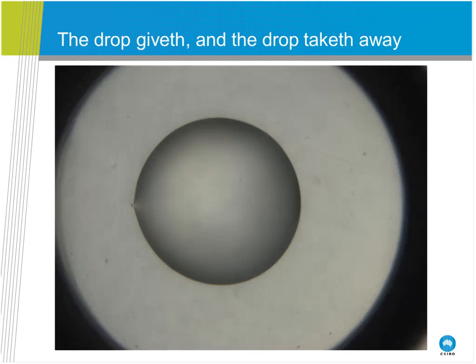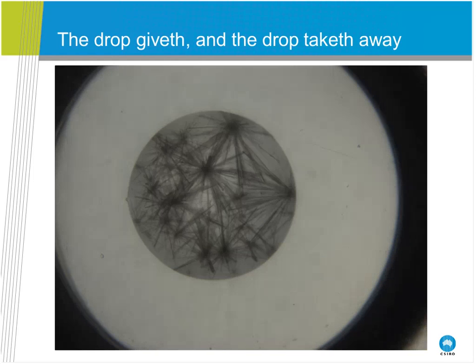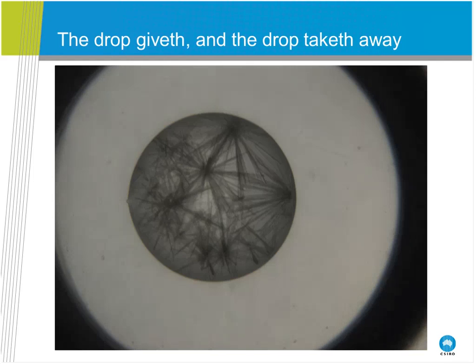And then we actually have to step through quite a lot of the time course until we get to about day 50, until we actually see that more crystals do eventually grow, but they don't look anything like those really quite stunning radial crystals that we saw before. So that just shows you that you can find things when you actually capture the time course that you wouldn't have otherwise seen, and we find that really very, very interesting.